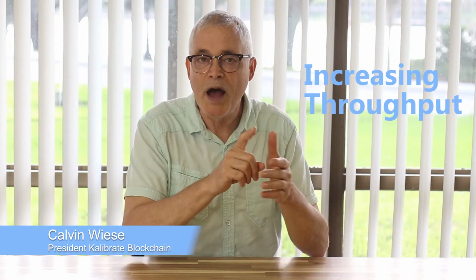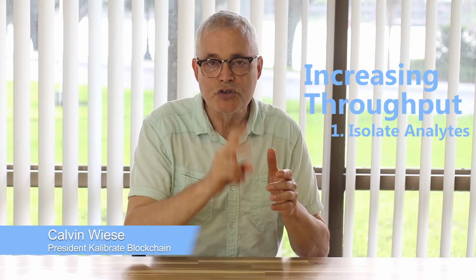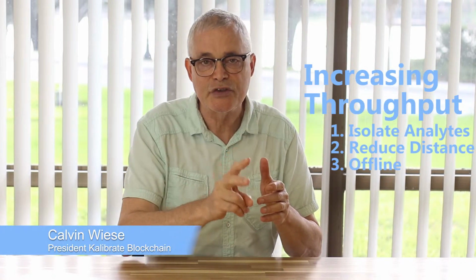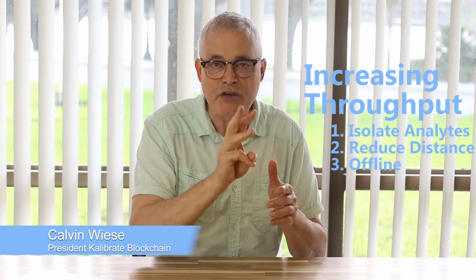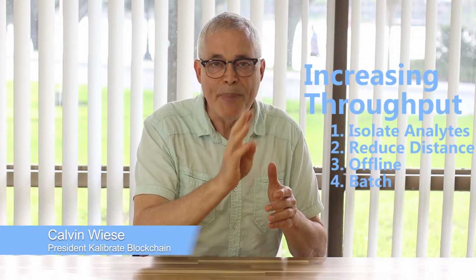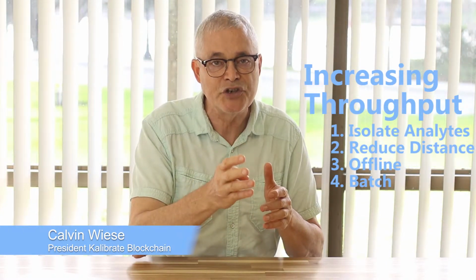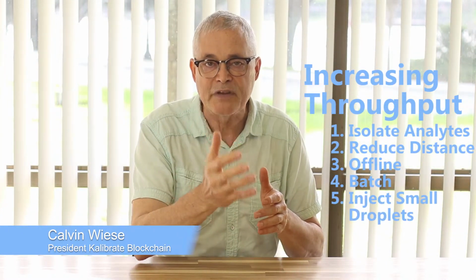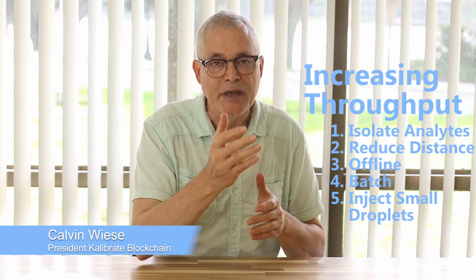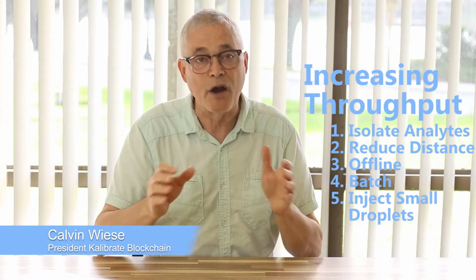If we can, 1, isolate the analytes from the other molecules; 2, reduce the distance separating the analytes; 3, do this offline from the mass spectrometer; 4, batch these samples in close proximity inside injection channels; and 5, inject batches of samples to the mass spectrometer as very small droplets, we can achieve our requirements.